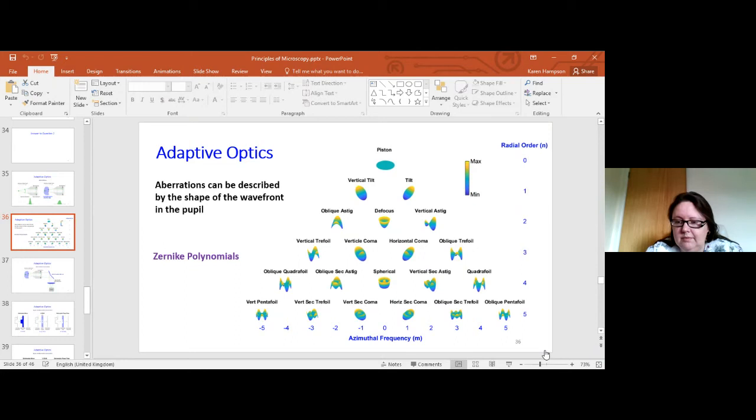Okay. Thanks for the answer. So we have another question from Ben Moon from USA. He asks, can you comment on the increased depth sectioning capabilities of confocal microscopy? Is there an increase in the fundamental axial resolution for a confocal system, or is this just due to the confocal gating, which rejects light from other layers?